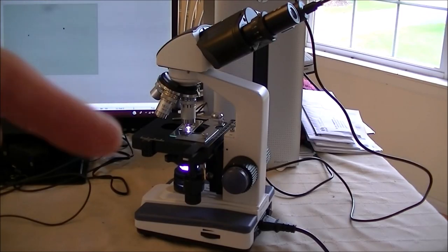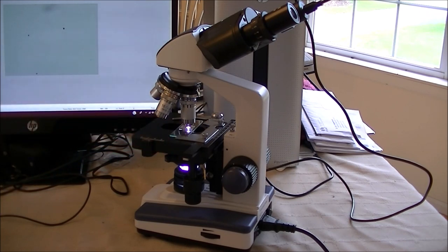Now we have our slide underneath the microscope, we have our camera set up which is on top looking through, and we're getting a live feed through the computer. Let's see what we can find, let's move it around inside our worm castings.